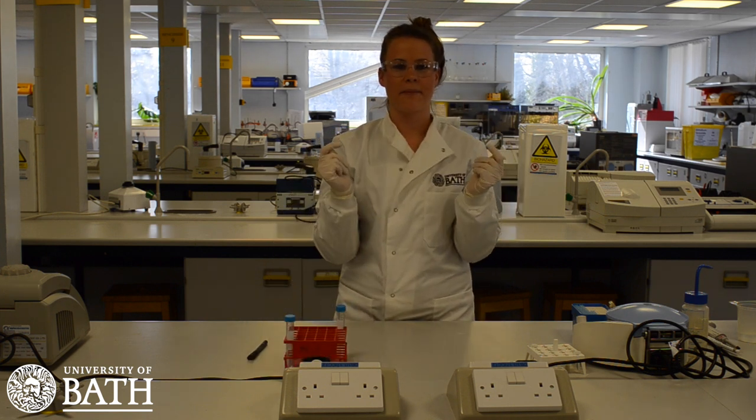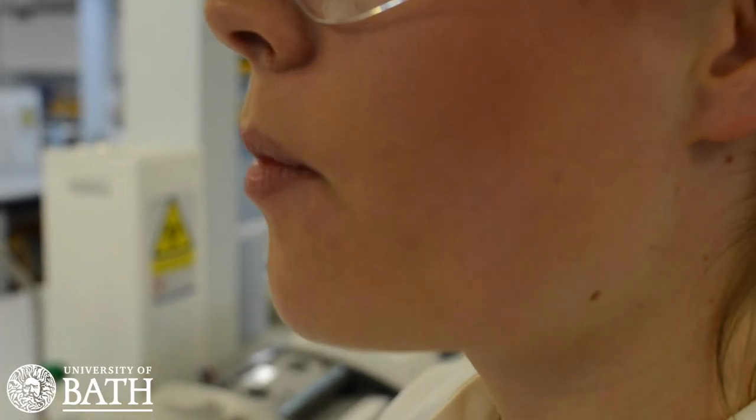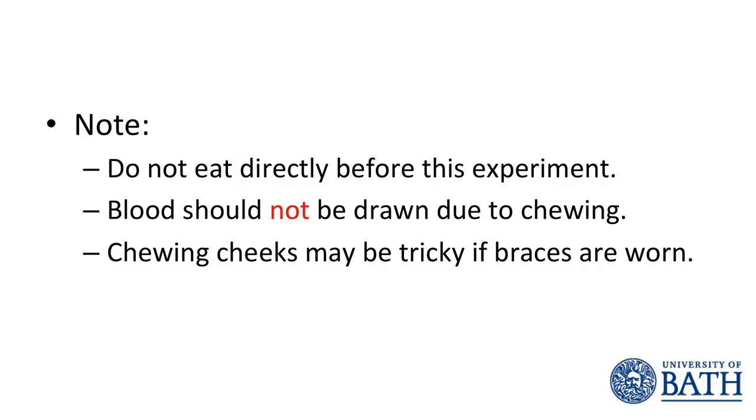The DNA used in this practical will be collected from your cheek cells. Gently chew the insides of your cheeks for around 10 seconds in order to dislodge cells for collection. It is important that you have not eaten directly before doing this, as this will have an effect on the number of cells that can be collected. Note that chewing the insides of your cheeks should not result in any blood being drawn.